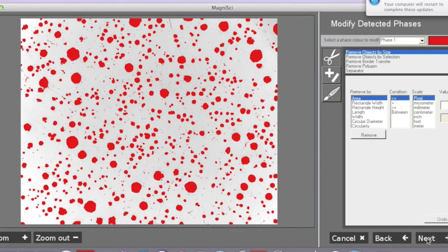Our third step will be removing the small noise. Here we remove particles under a specific size.